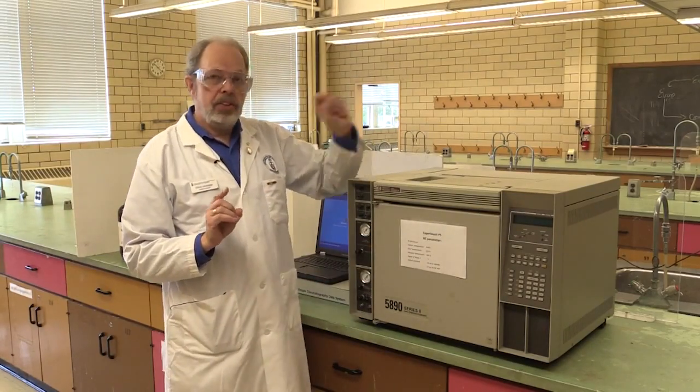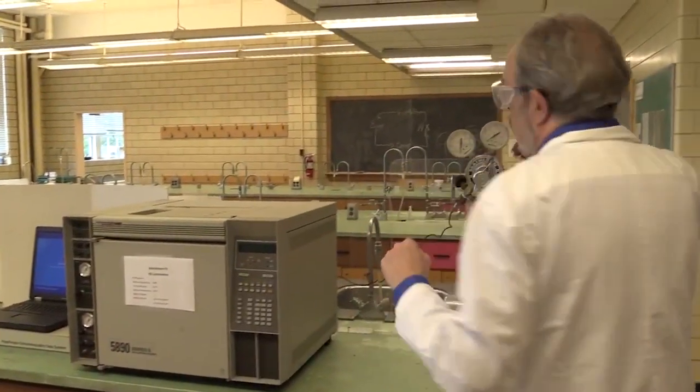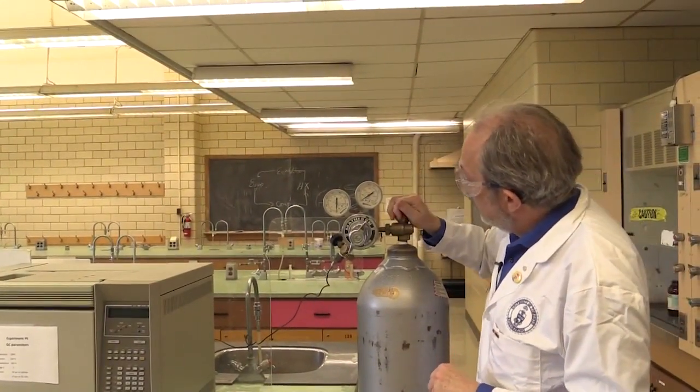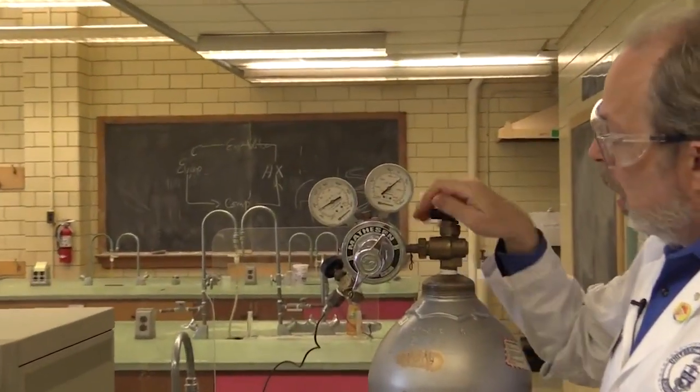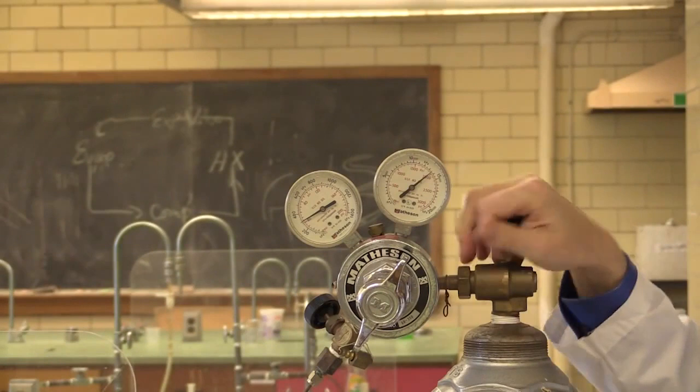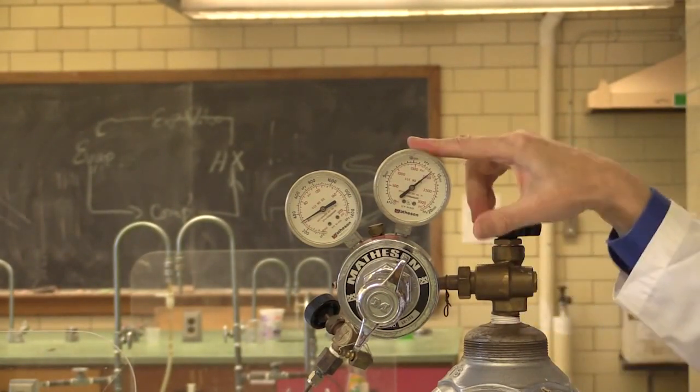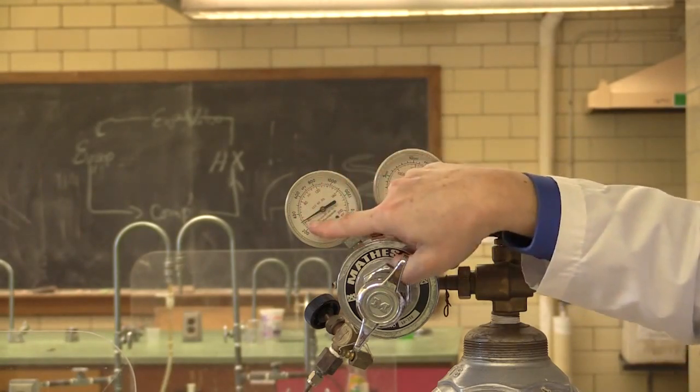The first thing to do is to turn the gas on, which is over here. The carrier gas is helium, and there's a tank of it here. Just open the cylinder all the way, righty tighty, lefty loosey, so turn it as far counterclockwise as you can. There's about 2,000 psi in here, and it's flowing out on this regulator at 42.